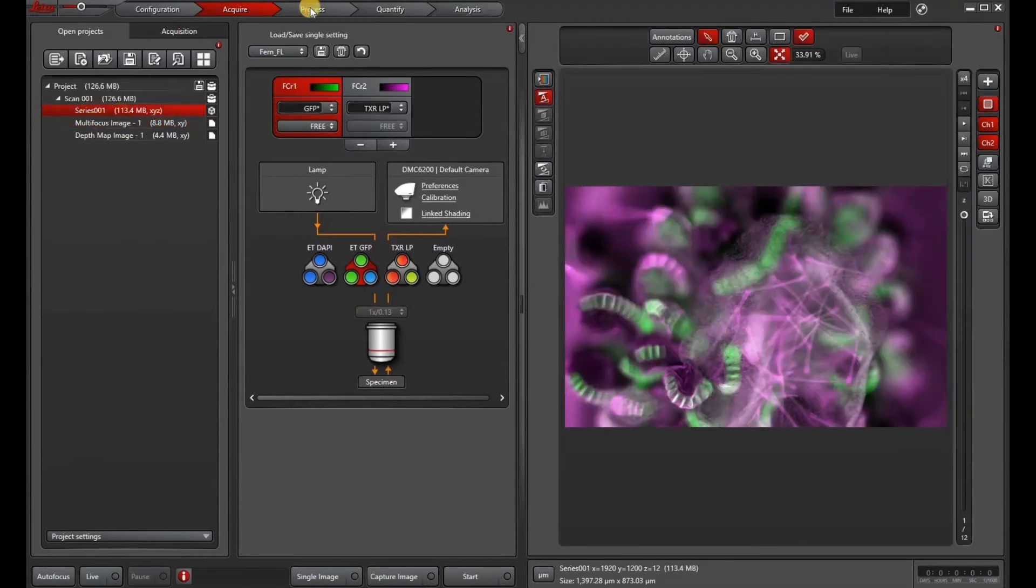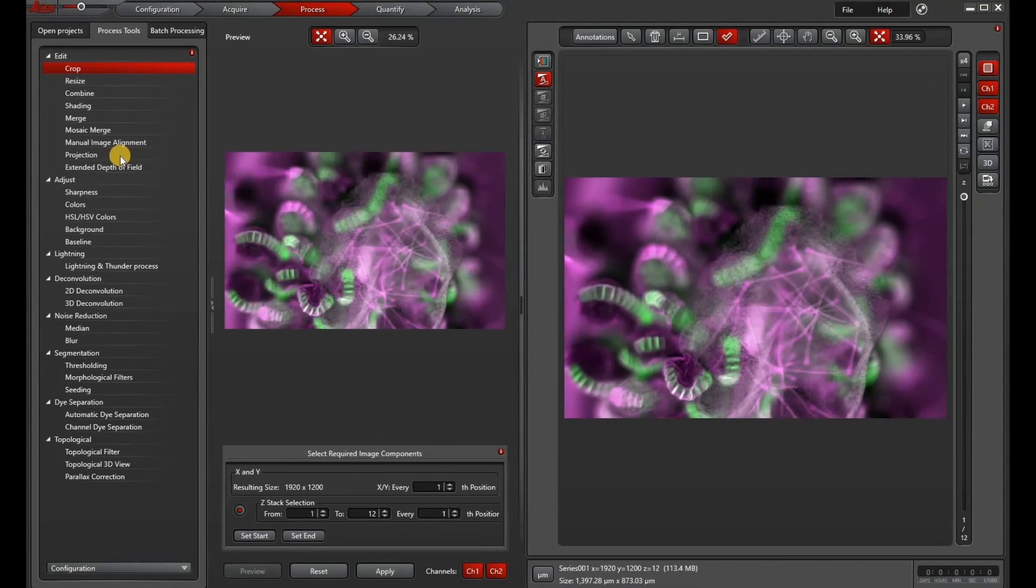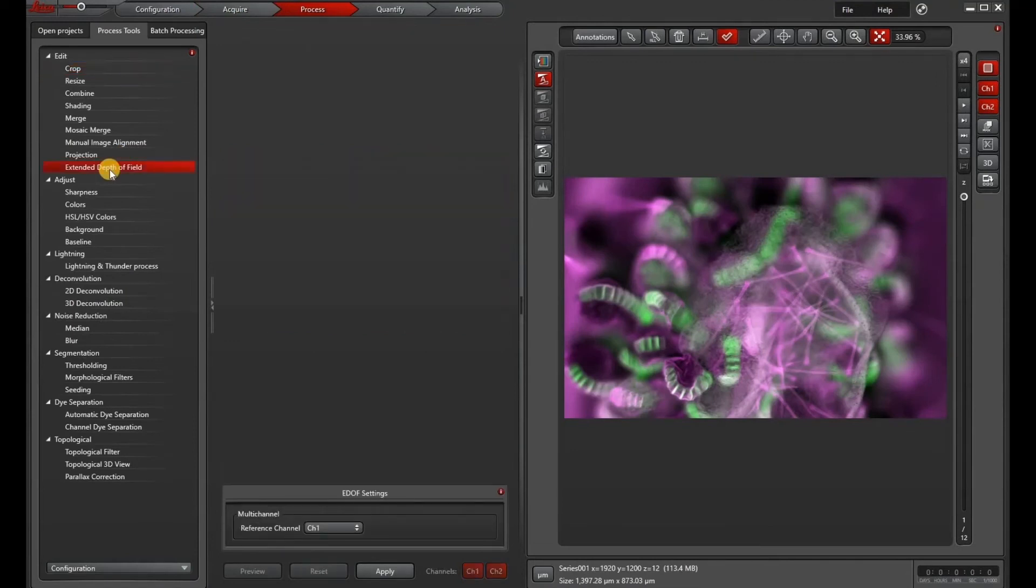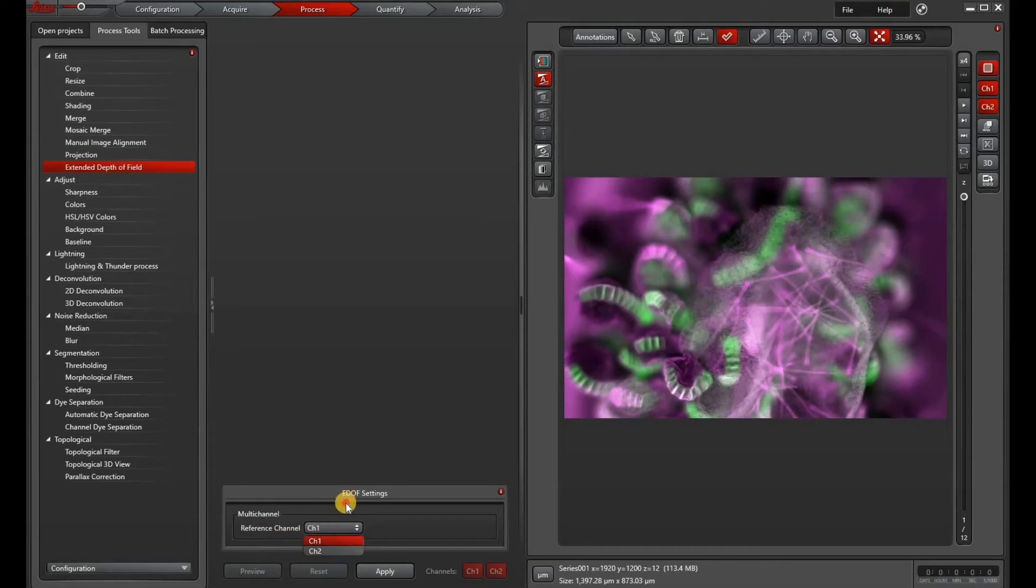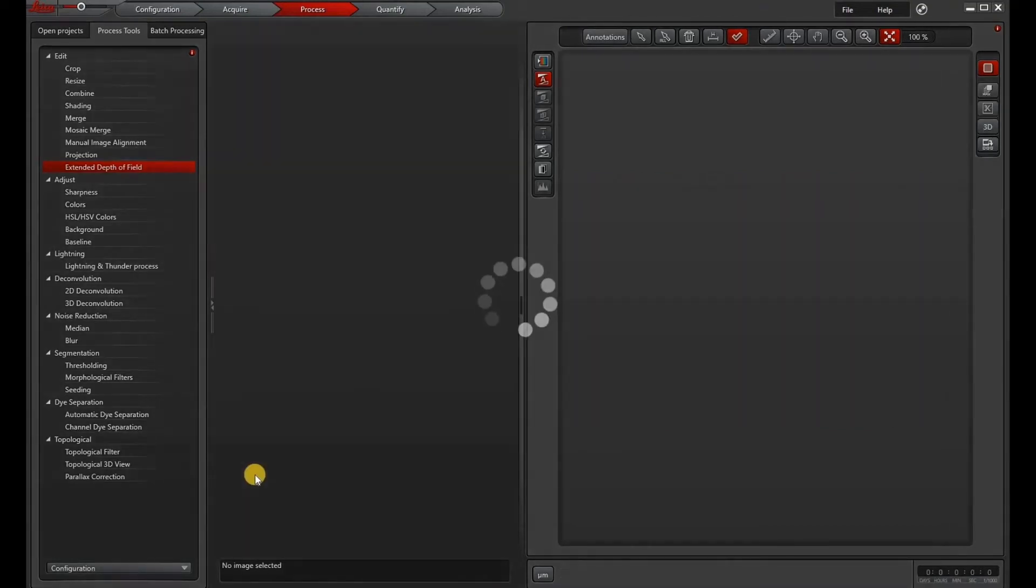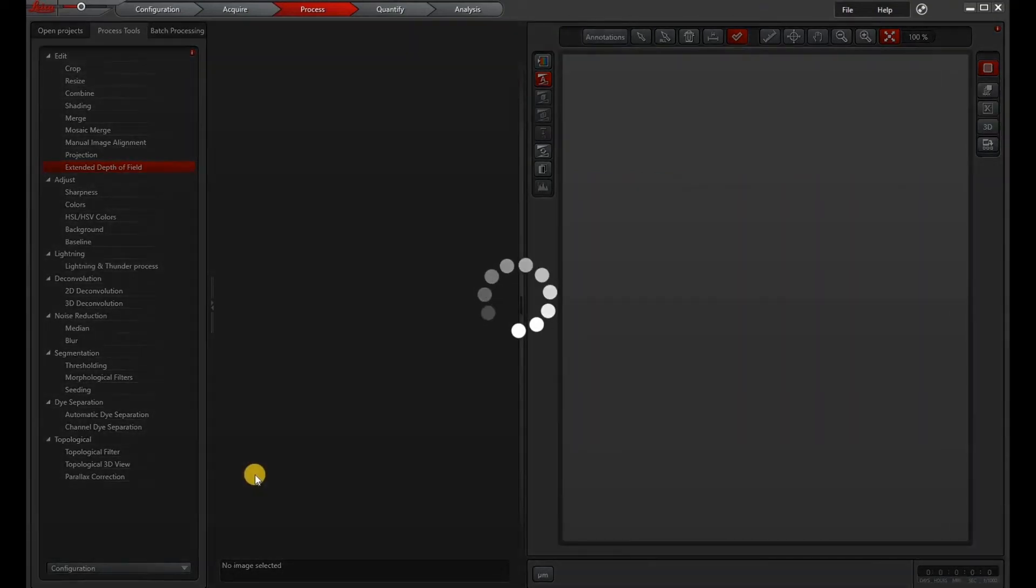So if you don't have the license for the create EDOF button in the z-stack window, you can always go to the process tools tab, select extended depth of field, and under the EDOF settings, you can choose a reference channel. This might depend on how clear or how many features you have in each channel. Once you've selected your reference channel, go ahead and hit apply.